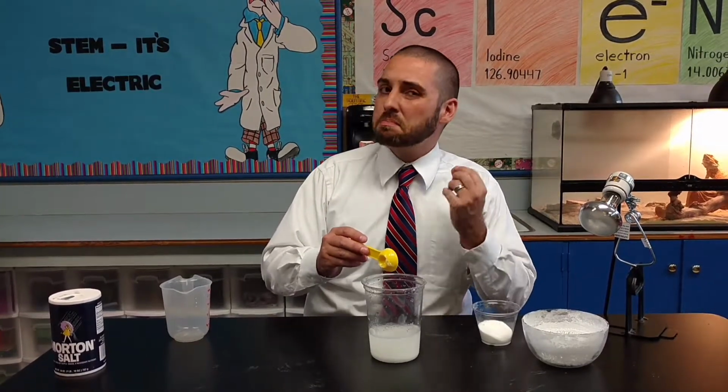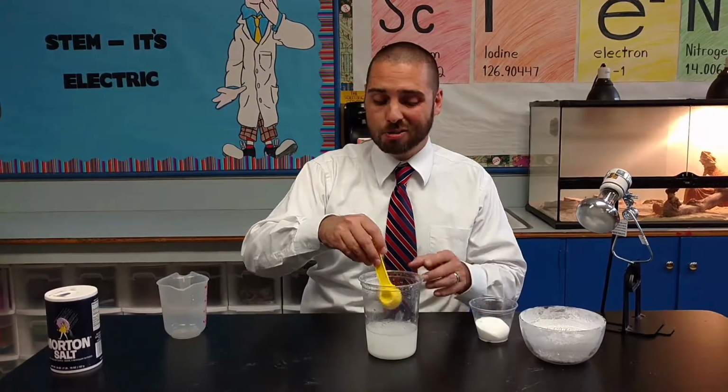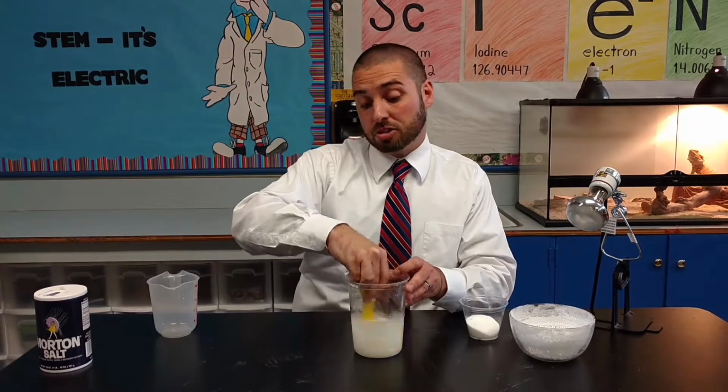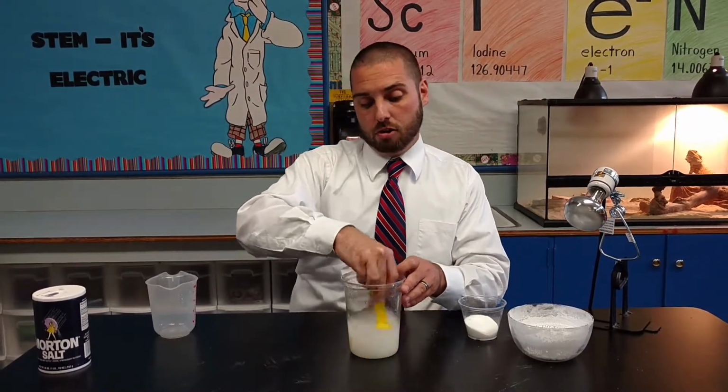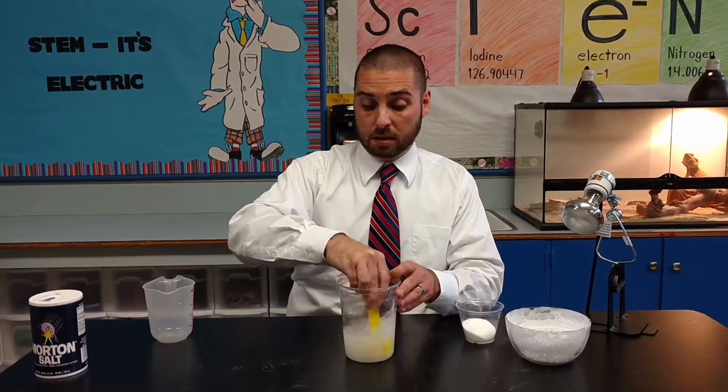Now some of that salt immediately dissolved upon making contact, but a lot of it didn't because we put a whole lot of salt up in there. So I'm going to stir it up to help as much of that salt as possible to dissolve within that water. Now, is all of that salt going to dissolve? No, but a lot of it will.